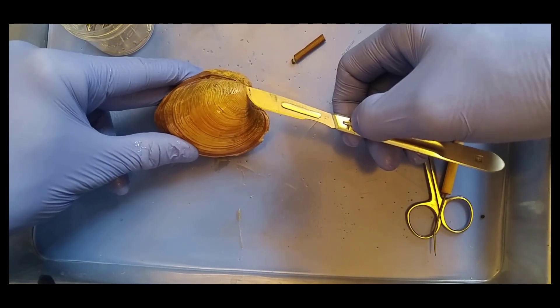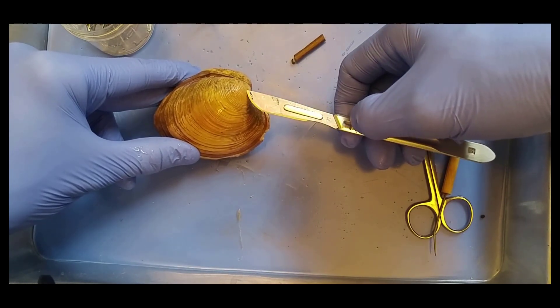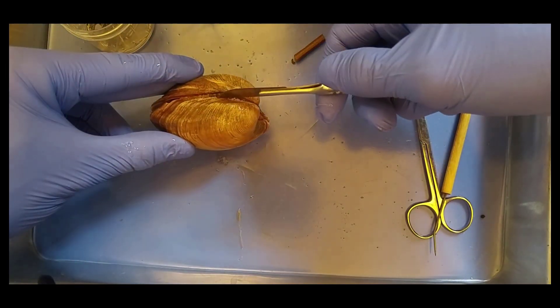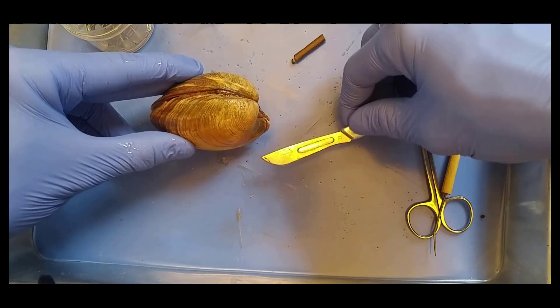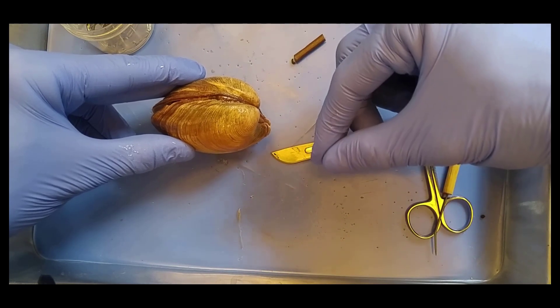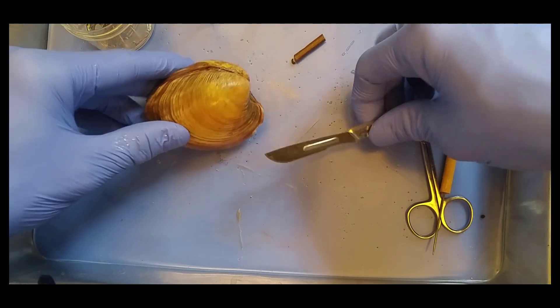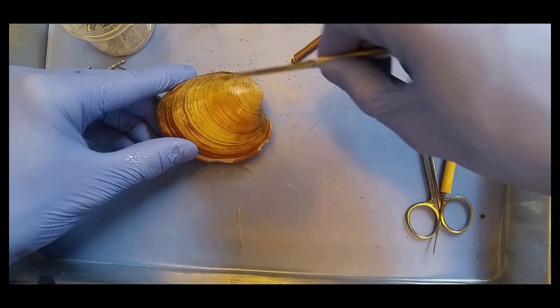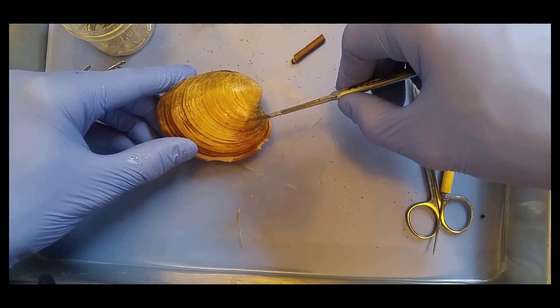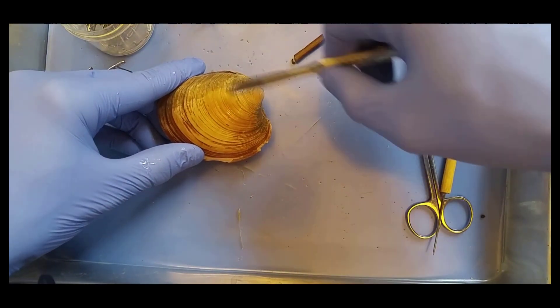Can you tell me what this is? The umbo. Good. And what is the umbo? It's the oldest part of the shell. And what about this right here? It's a hinge ligament. Like on a door that opens and closes things. Do you remember what muscles open and close the shell? The adductor. Can you say adductor? Adductor. Adductor muscles. And they're found here and here.